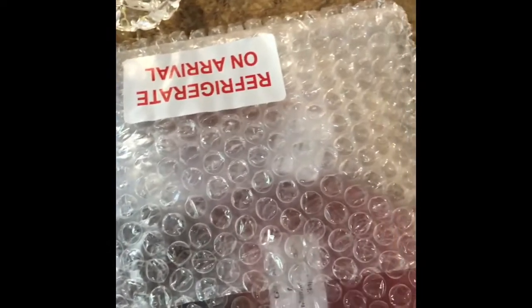And here's the plates for the selective and differential. We have MacConkey, EMB, and we have mannitol salt agar. So these plates I'm going to put back in the refrigerator, but I'm going to be taking these out again on Sunday when I need to inoculate them.